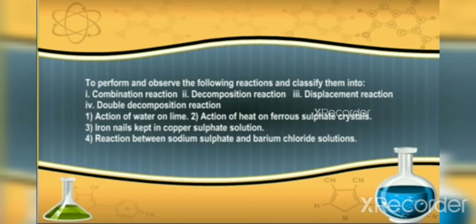Children, in this experiment, we are going to see one by one. So, what is the third experiment? That is to perform and observe the following reaction and classify them into combination reaction, decomposition reaction, displacement reaction, and double decomposition reaction. Let us see the procedure for combination reaction.